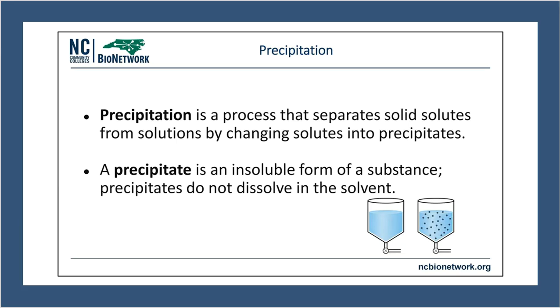So precipitation is the process of taking a gas or a liquid and precipitating out a solid, making a solid fall out of solution, so that way we can visually see it and maybe capture it and maybe do a little bit of cleanup on it in a later step. Or there is a chance that the precipitate is the trash. Maybe, just maybe, that precipitate is hazardous waste. And if we can precipitate that out of there, we can do a waste disposal of that.